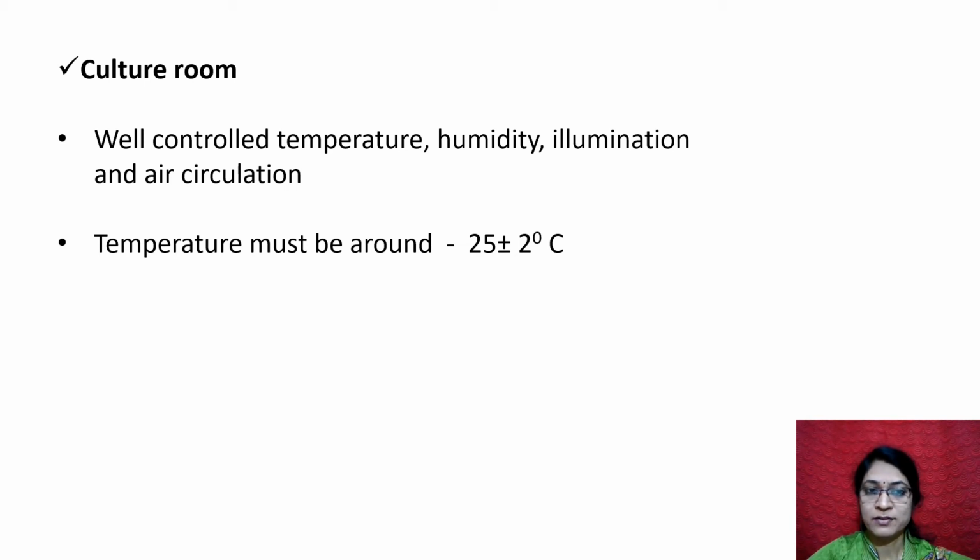Here, when we bring the test tubes or inoculated bottles, those are kept in the racks. The rack or each shelf must be equipped with fluorescent light, and at one end of the shelf there must be a small fan, and that fan is fitted with a tube which has uniform sized holes.